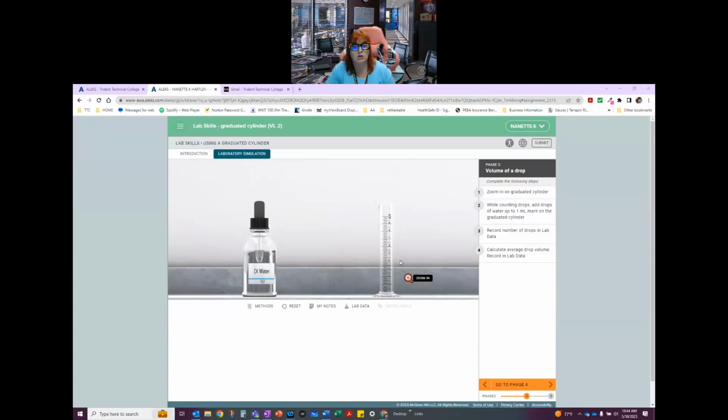But I'm currently in Virtual Lab 2. Now, Virtual Labs 1, 2, 3, and 4 are all due the same day. And they are set up so that's the Virtual Lab tutorial to show you how to enter numbers and where some things are. Virtual Lab 2, which is a graduated cylinder. Virtual Lab 3, which is a pipette and burette. And Virtual Lab 4, which is using a balance.